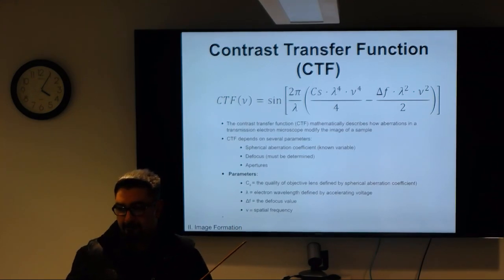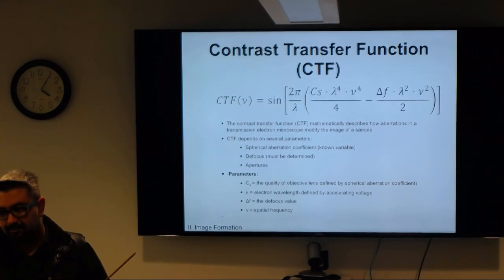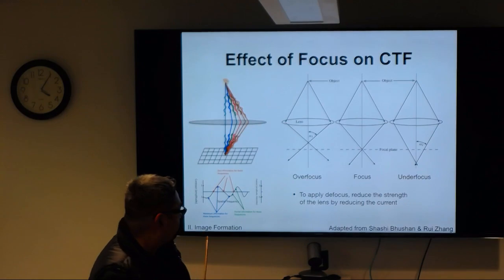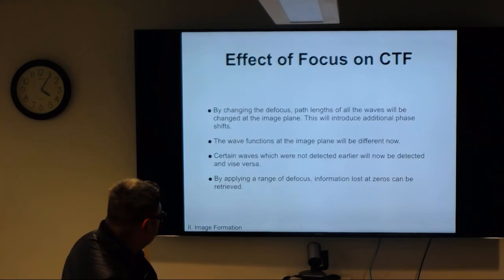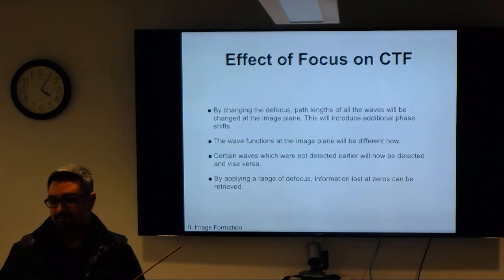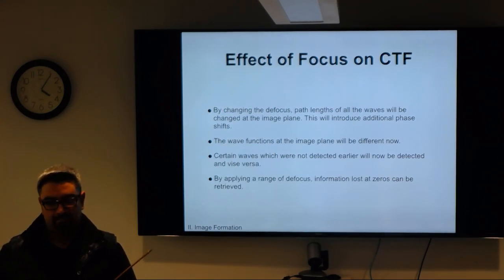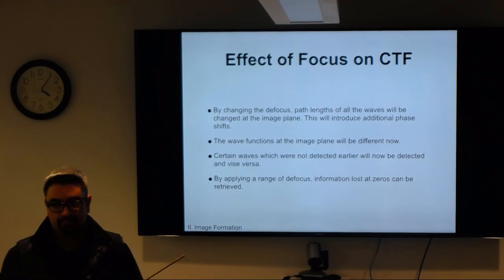And then CTF estimation software like CTFFIND will calculate the actual defocus value. So this is just what the microscope thinks is -2, but it might be -2.2 or whatever. Which is why some people just set one defocus value, and then assume that imperfections in the microscope or the stage or the specimen grid itself are going to vary it just naturally, so you'll cover enough of that CTF and you'll recover the information that you need.